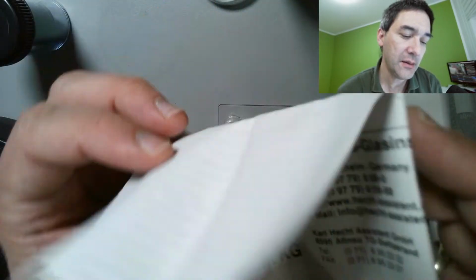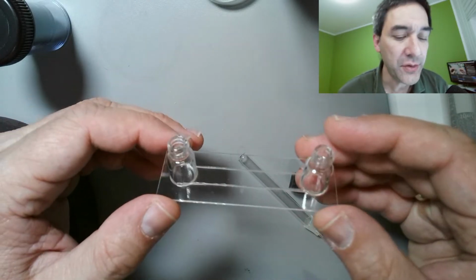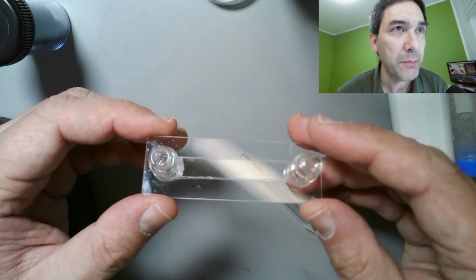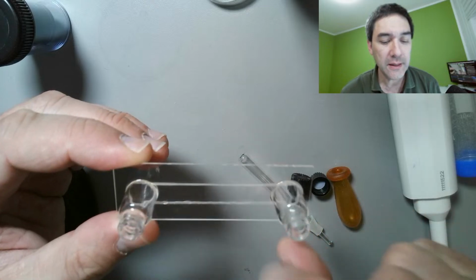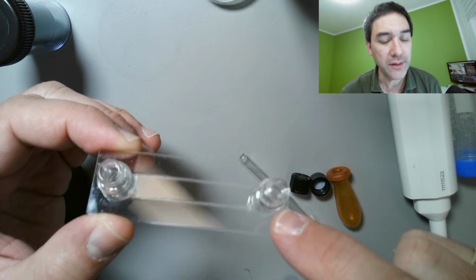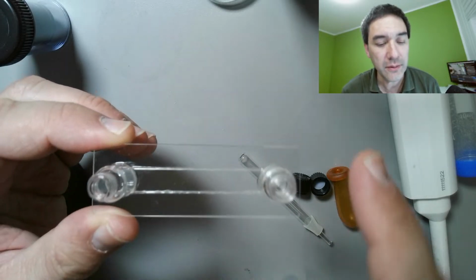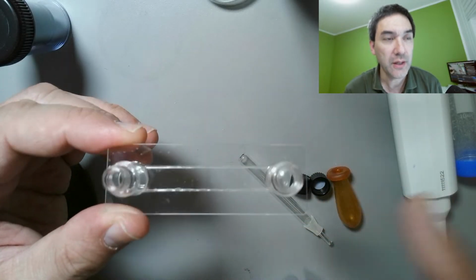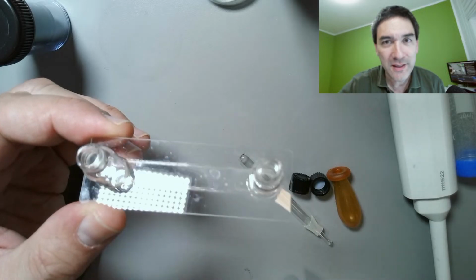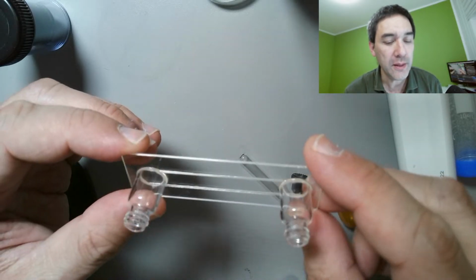So this is what I once did, and it was several months ago already. I put a culture with paramecia in here, and then I added an electrical current. And you could actually see that the paramecia were following the electrical current. You could move them left and right, depending on the polarity of the electricity. So this is actually quite useful.